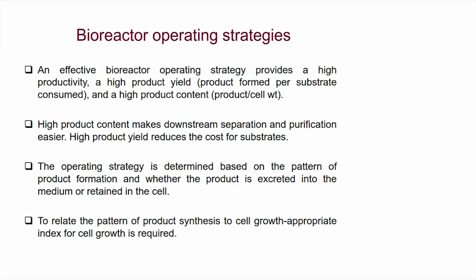Now, bioreactor operating conditions, apart from choosing the right kind of configuration, if you want to improve the productivity. We have spoken about different strategies which you can use to improve the yield or the productivity of the product. Under those conditions, you choose the right kind of bioreactor, you apply those conditions, and you get to some X productivity. Now, what is the limitation? I need to improve further beyond this. Is it done? Is the bioprocess now optimized? No, there is still ample scope for productivity enhancement.